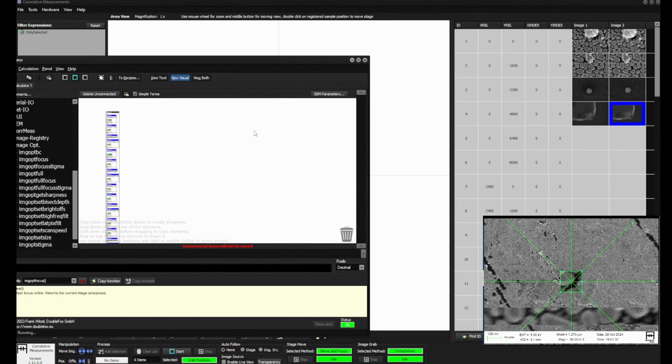Now it scans for the focus. That was the focusing stigmator. Stigmator has an effect. Let's see whether this can improve anything. Now stigma Y. Well, I think it did some improvement. Now focus again.